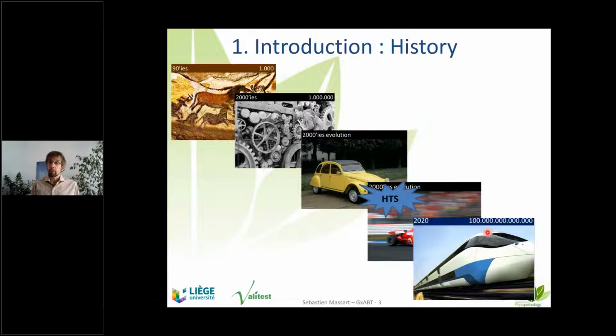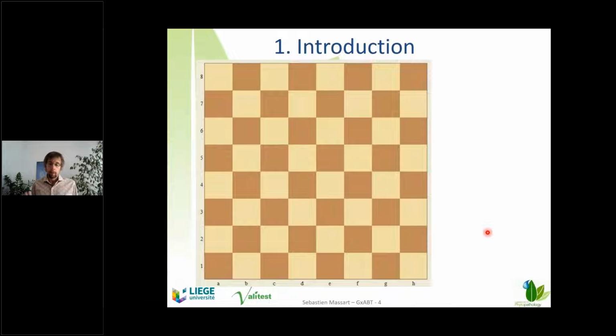A lot of work has been on viruses, but it's also very interesting for bacteria, fungi, nematodes, insects, or other arthropods, or even invasive weeds. There are applications of high throughput sequencing to scan the pollen, for example, of plants, including even invasive plants. So this is an exponential curve of high throughput sequencing, in terms of output and throughput per day, but also a reduction in cost, making it more and more affordable for plant pest diagnostic.